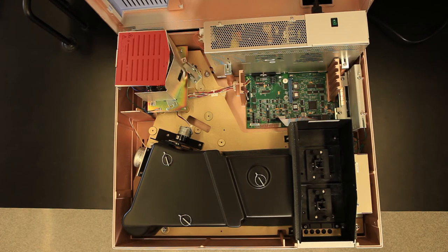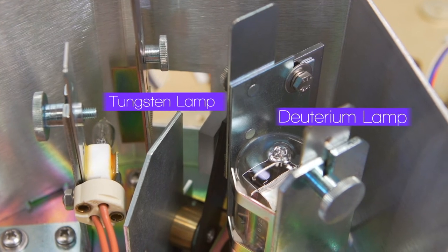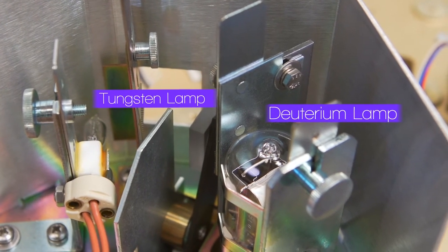There are two different light sources present: a deuterium lamp for UV wavelengths, and a tungsten halogen lamp for visible wavelengths.